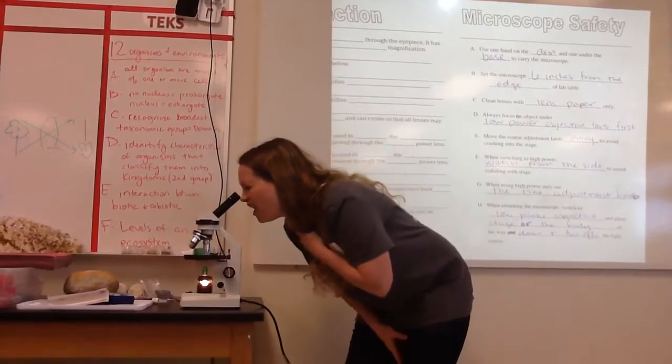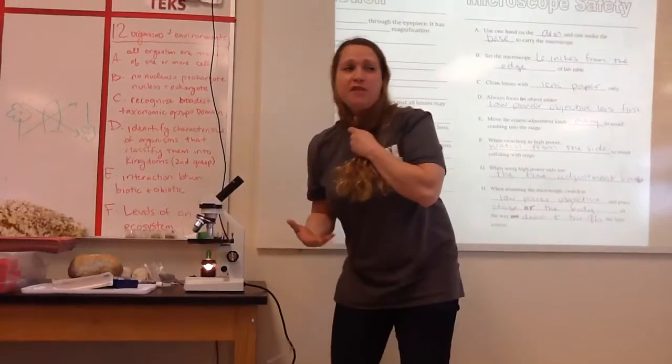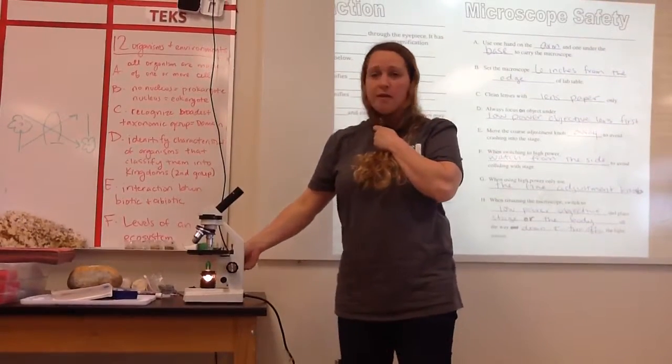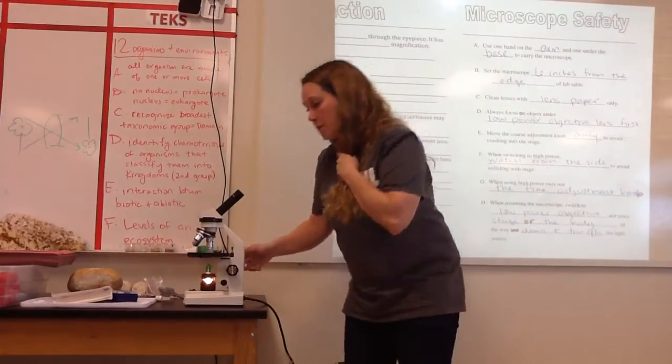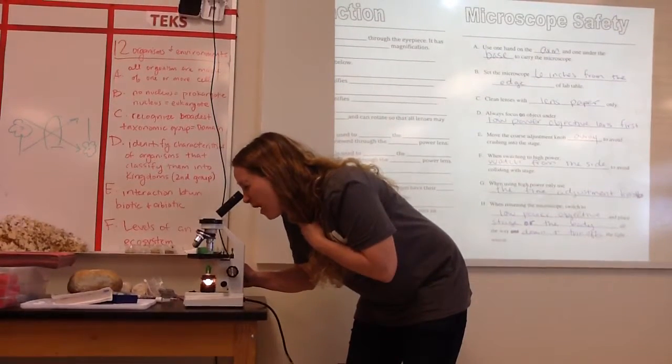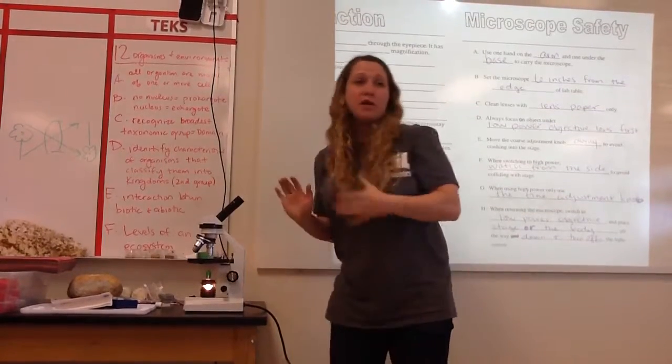So I put my eye on. I don't see anything really clear, so I need to see if it's still there. I'm going to take my knob. Can I just go forward and get close again? No, I can only back up, so I'm going to back up and see if it's still there. Back up, back up. Oh, and now it's in focus really well, so I don't need to do anything, okay?